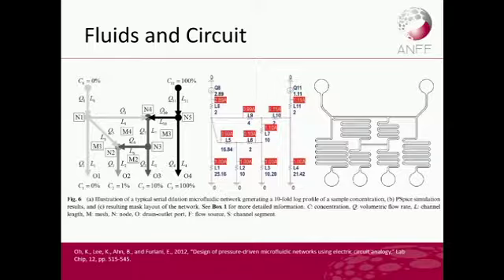So this is an example of how the calculations or the equations before are implemented from a design into a microfluidic device. You can set the conditions, and also set certain channel dimensions, and from there you can work it out. Now, people will probably say there's also software out there that can do these generations for me.